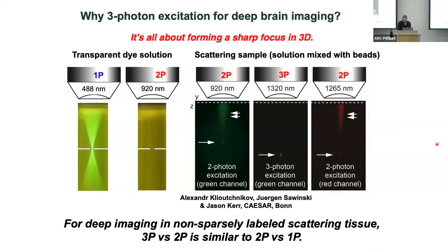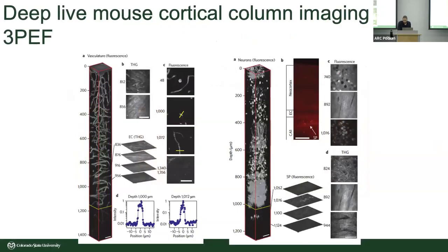Okay, one more question in the chat. How do we use the two-photon microscope that you built? Great question. This is probably the most important question to talk about. I wanted to ask a practical question. How do we use the two-photon microscope that you built? Is there a system in place to train students? How do we write its capabilities into grant proposals?